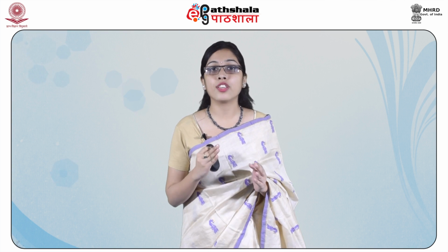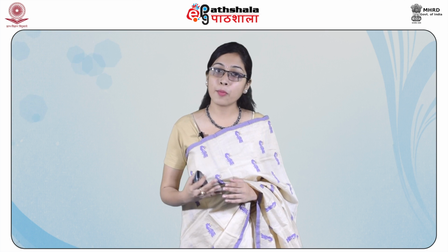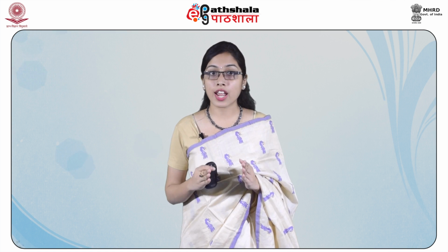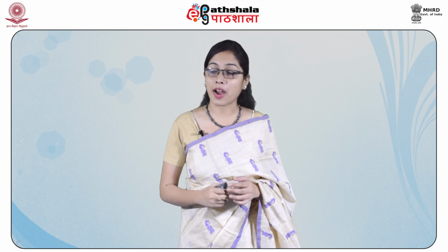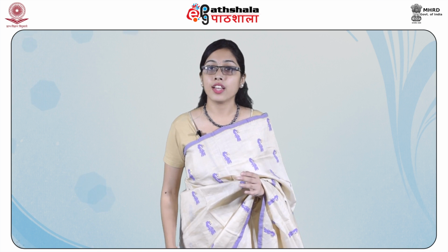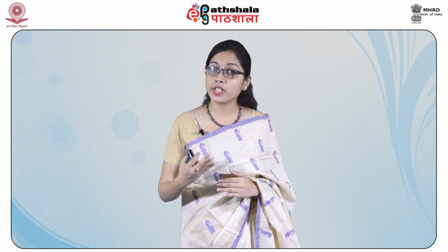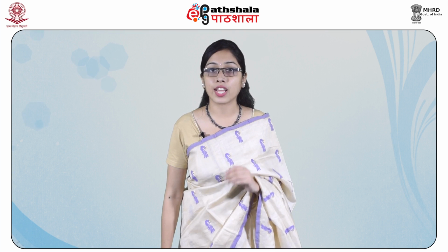Paper chromatography is a useful technique for separation and analysis of molecules because it is quick and requires small quantities of material. The equipment for paper chromatography consists of a vapor-tight glass chamber with inlets for addition of solvent in addition to supports for solvent troughs and chromatography paper. In paper chromatography, a volatile solvent is used to carry the components of the sample along with the paper. This is called the developing solvent. The choice of solvent depends on the chemical nature of the material to be analyzed and needs to be optimized for every type of mixture.